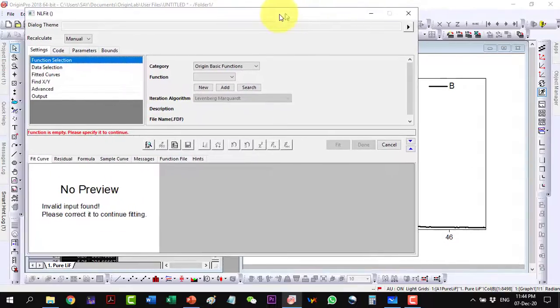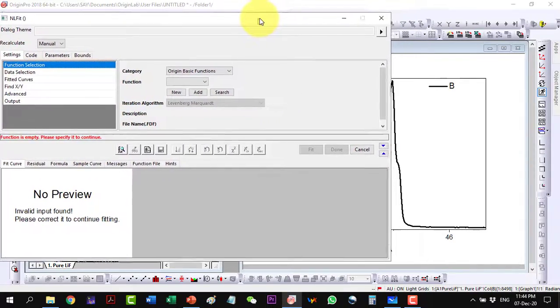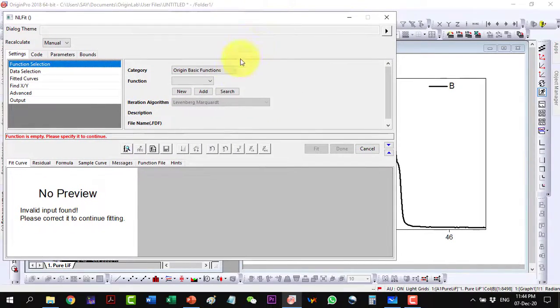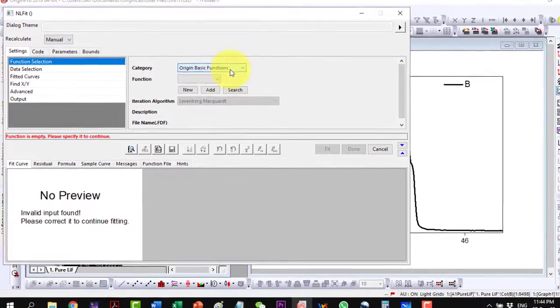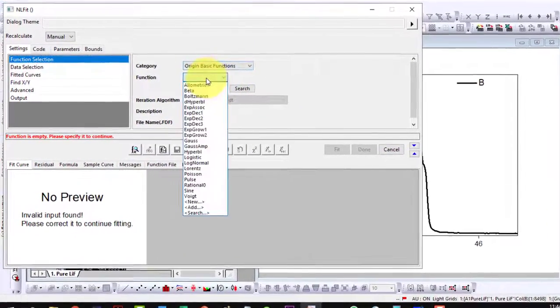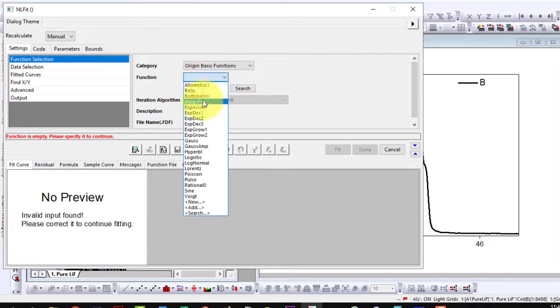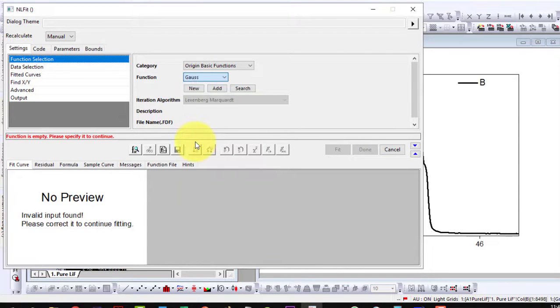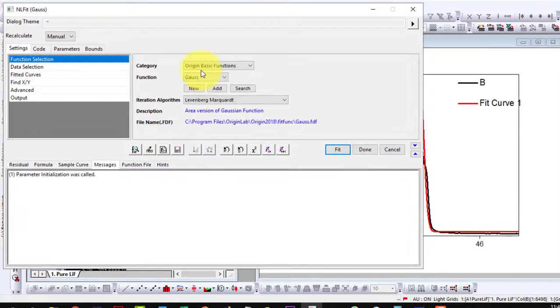We are having this is the common dialog box for the Origin functions and here I select the Gaussian which is here.